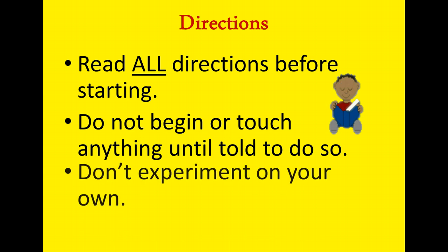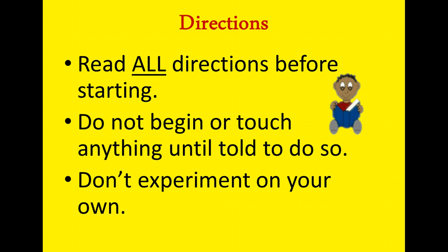Next, please don't experiment on your own. Sometimes you don't know what kind of reaction will happen when you put two things together. And so to be safe, if you ever want to do something on your own, please ask me first before you do anything.